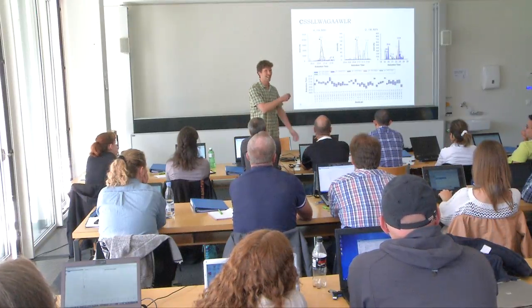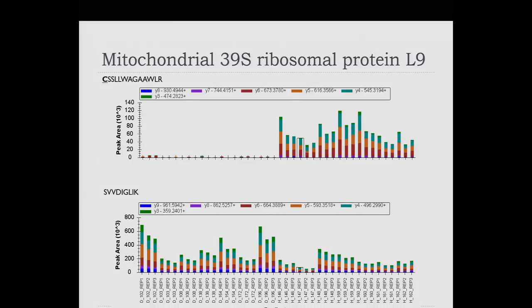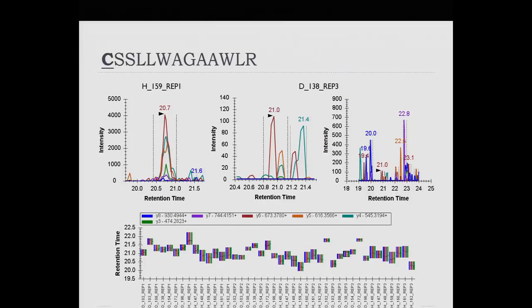I manually said, I don't know what Skyline would pick; probably something that looks to it more like a peak, and not necessarily pick that. Yeah, so I had to go in and actually manually choose this. So then a useful feature in Skyline is that you can order. We've been looking at this logical ordering with all the diseased on one side, all the healthy on the other. It's very easy in Skyline to just order everything by acquired time. So this, I can actually see how the data was acquired.